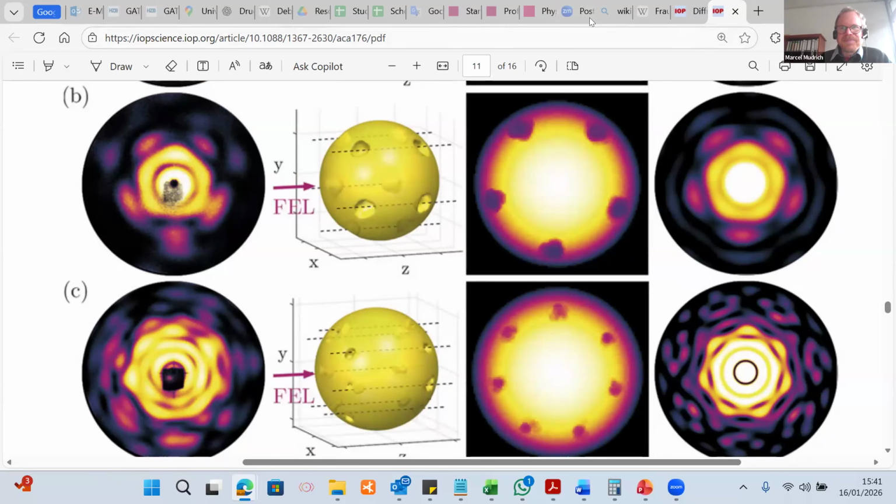All right. I didn't want to give another full-fledged presentation. This is just to give you some more glimpse of what's going on in this diffraction imaging community, and what kind of exciting and interesting nanoparticles and nanodroplets you can image. And pump-probe dynamics is definitely the way to go in the future to study not only static structures, but actually see how these structures evolve, mostly upon laser irradiation triggering some specific heating or some specific excitation in the droplet or in the nanoparticle.